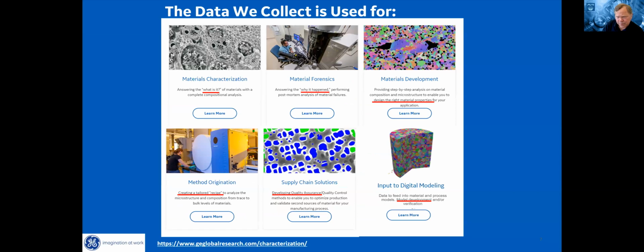Before jumping into the surface analysis, we just need to stress there's a number of things that people get out of the data that we provide. The first thing, we call it generic materials characterization, and that is, what is it? Somebody brings you a part, they need to know compositionally what it is, microstructurally what it is, what's the phase, so we provide those details. We also do materials forensics.